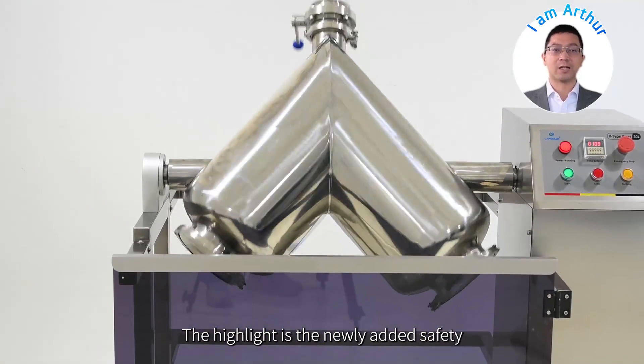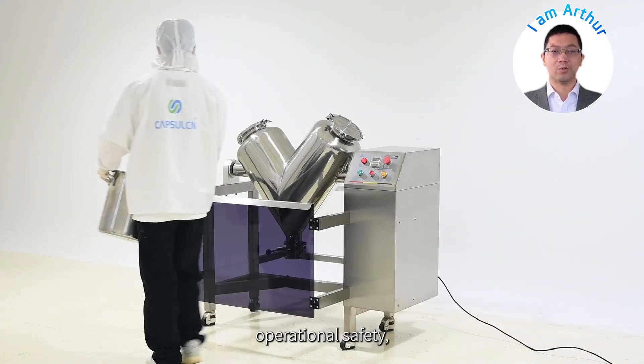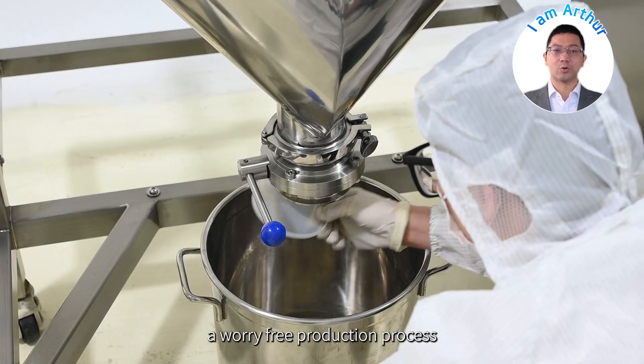The highlight is the newly added safety guard rail design, which surrounds the V-shaped barrel to effectively protect operational safety, isolate accidental contact and ensure a worry-free production process.